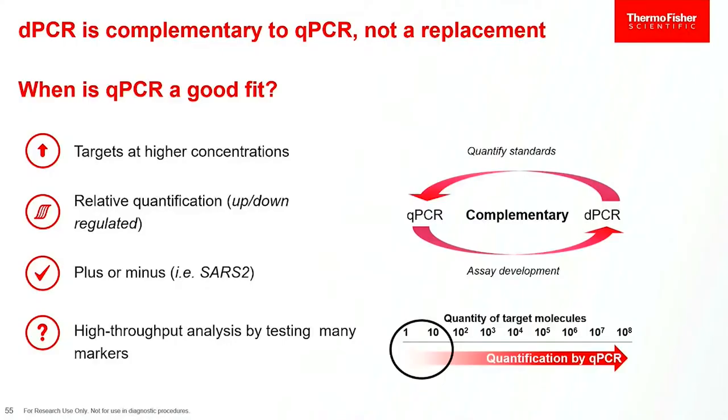All right, where digital PCR tends to really shine is down here, when we lose the ability to quantify. This is somewhere around CTs of 36 to 40. If you do the math, because we all love math, right? If you have one copy of material and perfect twofold growth, you will get a CT of about 40. You'll be able to see that after 40 cycles, okay?